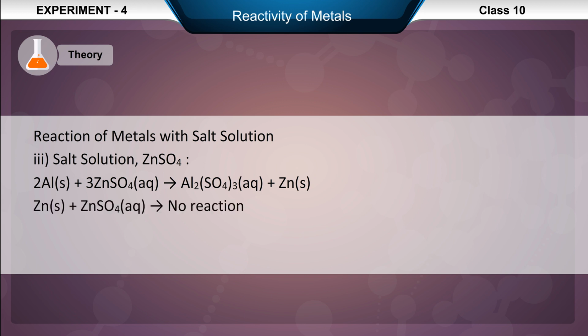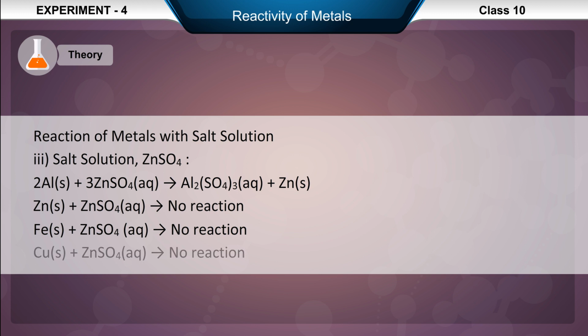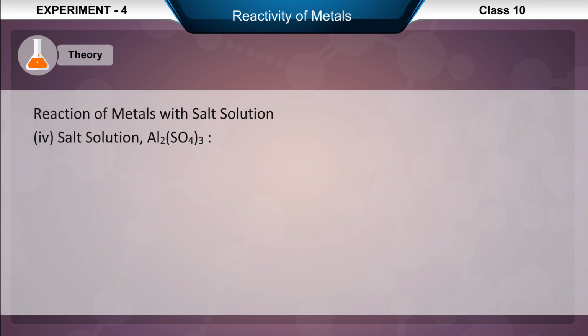Zn, Fe and Cu in solid state plus ZnSO4 in aqueous state result in no reaction.